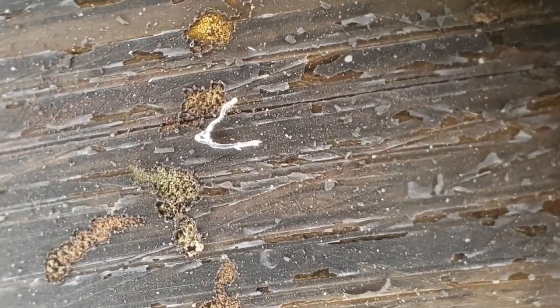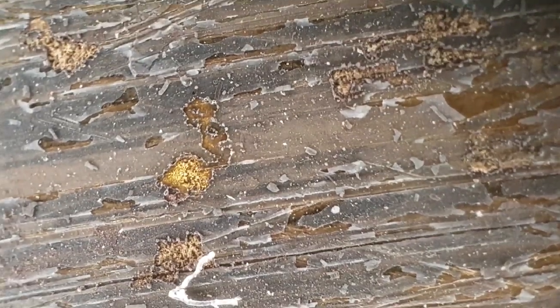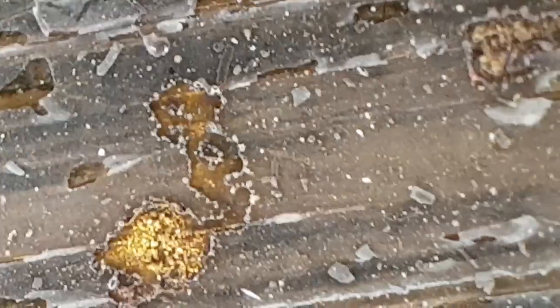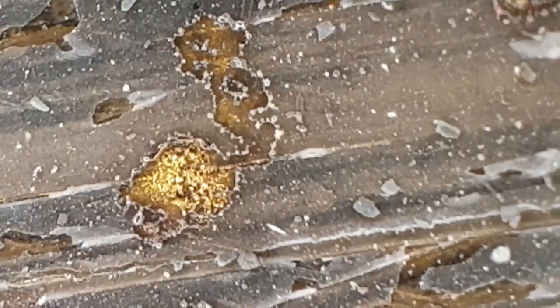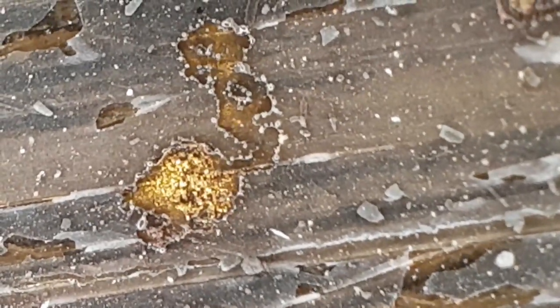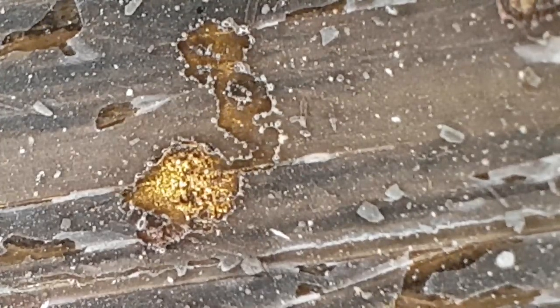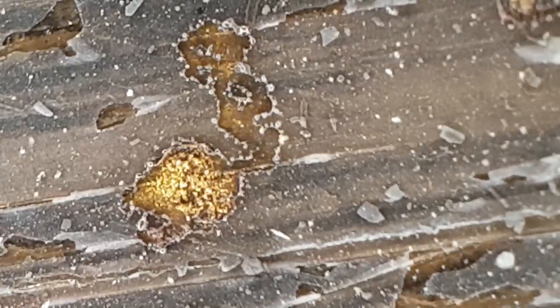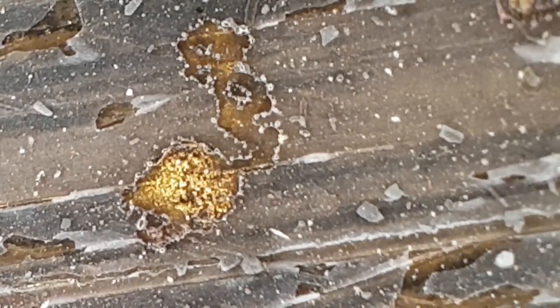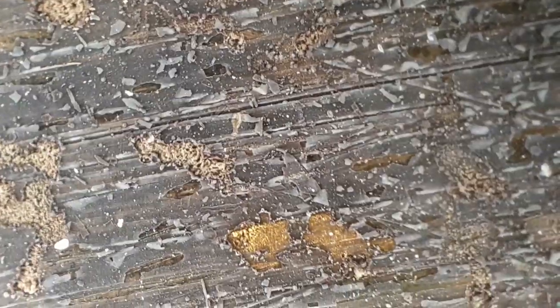That's probably just a piece of lint, a perennial issue. So it's a piece of fiber from someone's clothing. There we go, so it's run around on the surface. So whatever it was on the surface has been etched away. And maybe there is some zinc that was sublimed, or some lead that was sublimed, or tin that was sublimed from the brass and spread out between the plates. And maybe that is what this is then moving through and creating these little trails here.